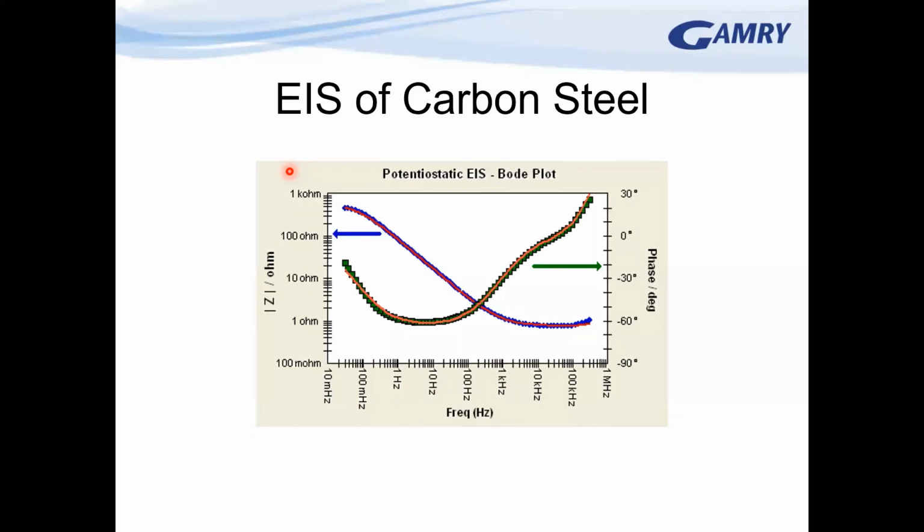Okay, and since we just mentioned preparing a surface, what role does sample surface pretreatment play in these measurements, and is there a recommended method for preparing your surface, such as hand polishing with a specific grit of sandpaper? I don't remember exactly, but in some of the ASTM standards, they definitely prescribe a certain amount of polishing. I think they say 600 grit or something like that, but I can't remember for sure. I'd have to look it up. But yes, you should start with a clean, polished, prepared surface.